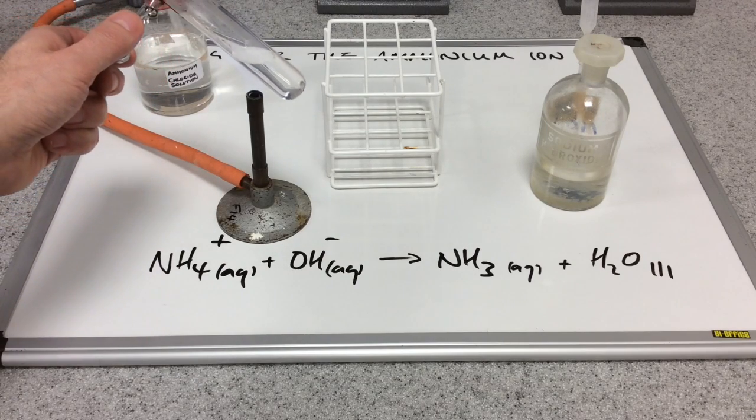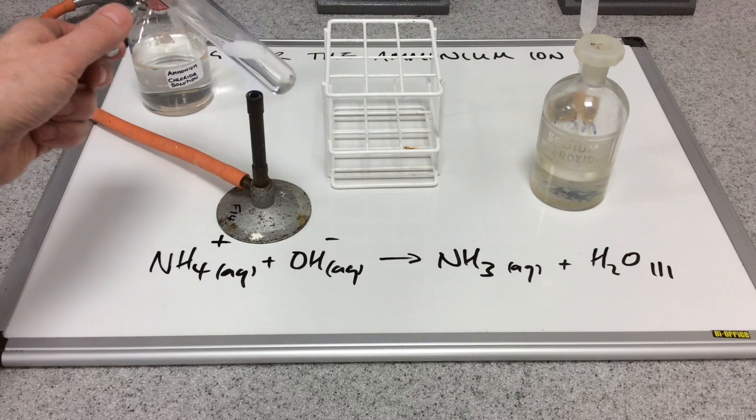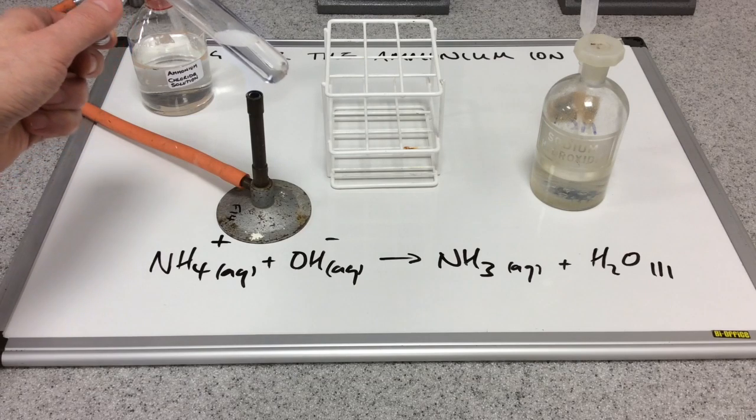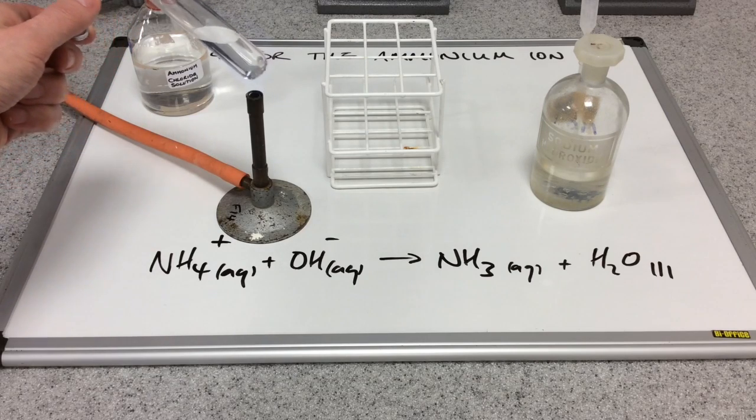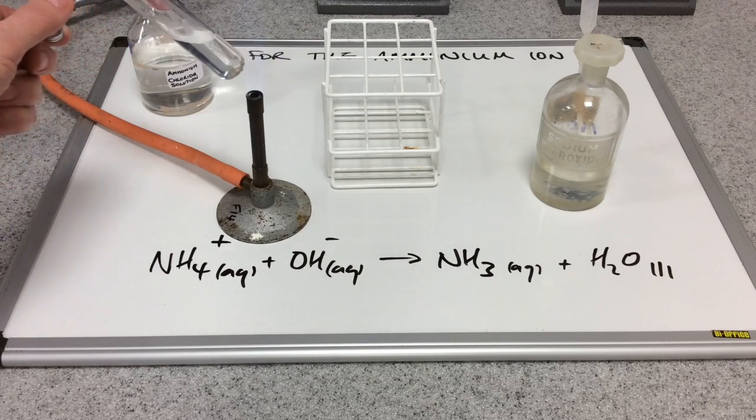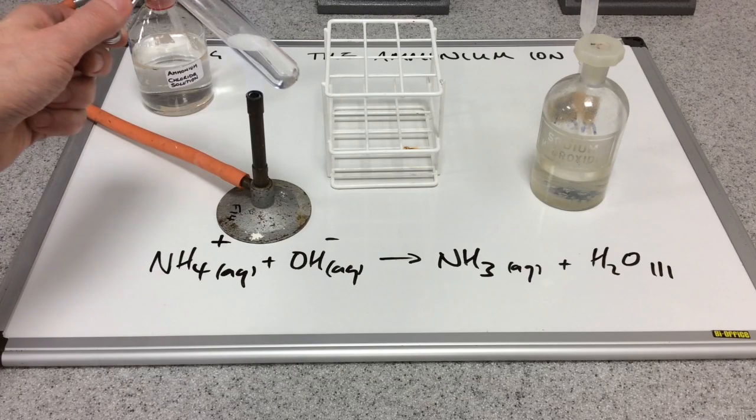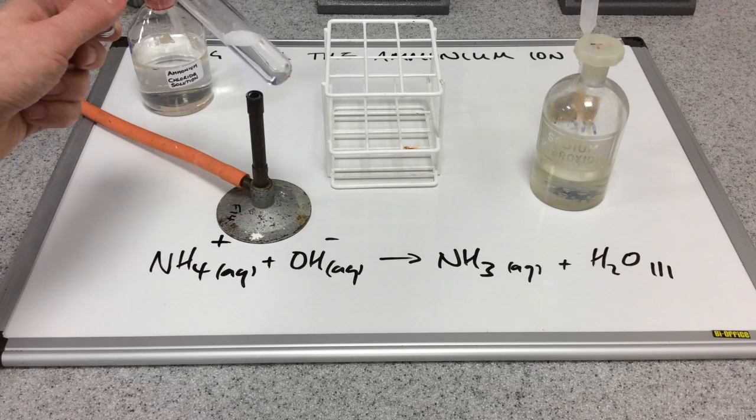I'm just warming the contents of the test tube. We're trying to turn that ammonia that's dissolved in the water into a gas, and hopefully it will do something to this damp red litmus paper.